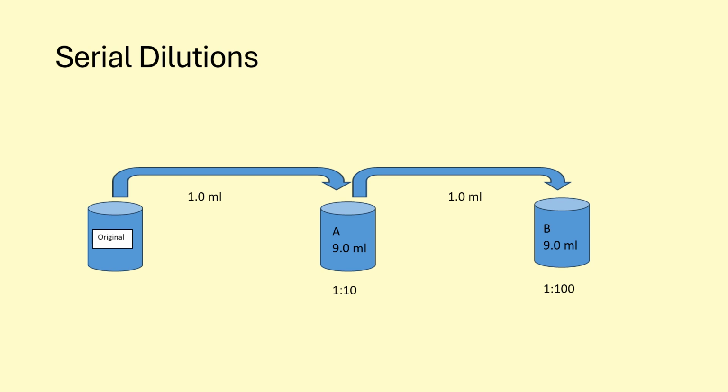Let's say you're working with a water sample. Is it safe to drink? Depending on the numbers, you might say, okay, it's safe to drink, numbers are really low. Or you might say, ooh, those numbers are pretty high. Maybe it should not be described as being allowed for human consumption. Maybe we can use the water to water a golf course, but you can't drink it.